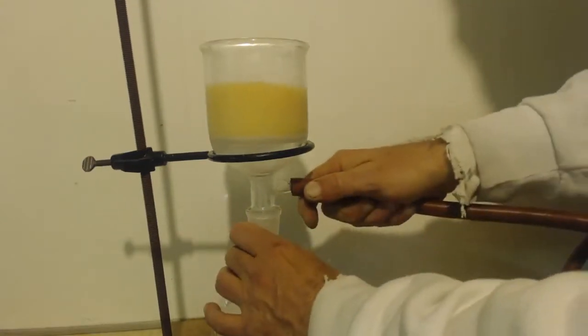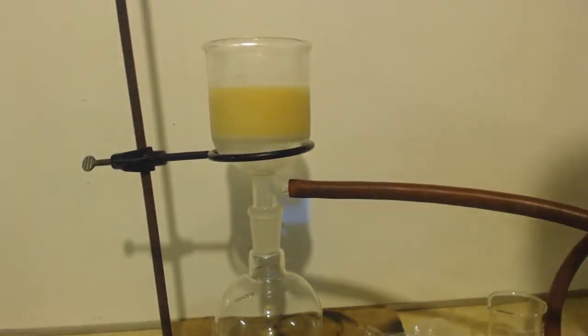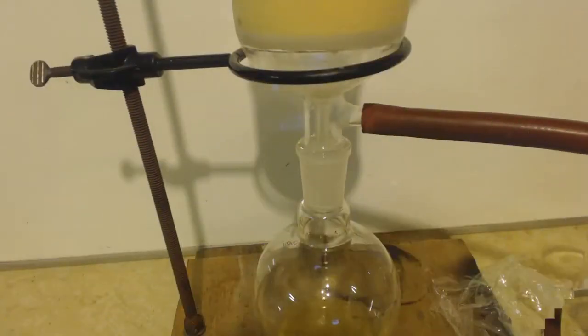Let's do this quicker. Oh, it must be frozen. All right, well, I'll come back when I got it all filtered out. Oh, you can see it's going now. I just wish this frit funnel... I put water through it so I can clean it and then I put it in the freezer. I must have put it in too long because it was still a little bit wet. It wasn't like I dried it in the oven or anything. Must have froze up there. So as you can see, it's going now.